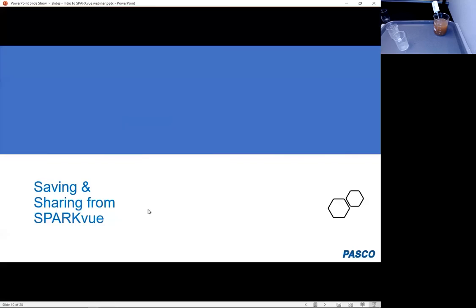Let me tell you a little bit more about Sparklabs. Sparklabs are the proprietary form of all the information in your Spark file. So they are proprietary, so it requires Sparkvue to reopen it. But the good news is that Sparkvue works on any platform. So I could send this over to Dan's iPhone, and if he has Sparkvue, the free app on his iPhone, he can open up this lab and do his own analysis and continue collecting data if he had a temperature sensor. So the Sparklab is a complete record of the file.